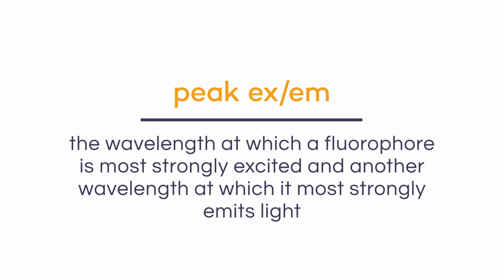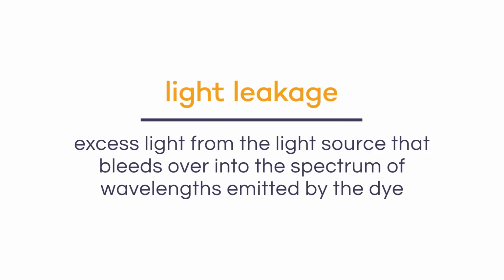Every fluorophore has a particular wavelength at which it is most strongly excited, and another wavelength at which it most strongly emits light. These wavelengths are often referred to as the peak excitation and peak emission wavelengths, or peak Ex/Em for short. We want our light source to powerfully excite the dye at its peak excitation wavelength, but not to bleed over into the spectrum of wavelengths which is emitted by the dye, because this will be picked up by the detector. If this happens, this is referred to as light leakage, and this can negatively impact the signal-to-noise ratio and therefore the sensitivity of the assay, since the excitation light would be wrongly captured in addition to the emitted signals.